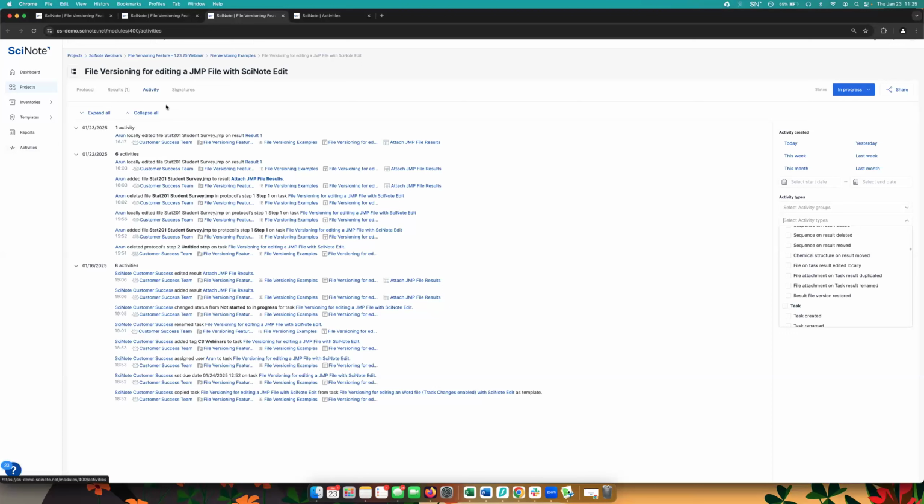specific to your task. And once you're in here, as you have a lot of content in the task, this list or this log can get quite comprehensive. So it's not necessarily the easiest to search through, which is why we have some filters that you can use on the right. So we've got a wide range of filters that you can pick from.